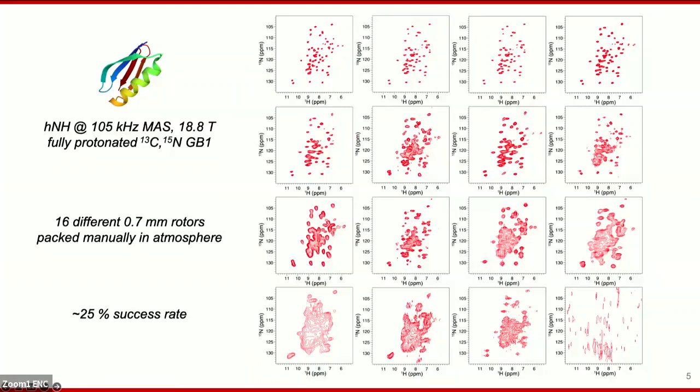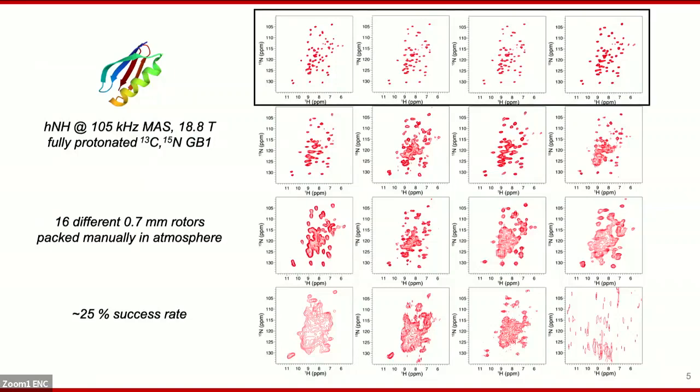So when we design a packing process or a packing tool, we want to make sure that we're so confident in this tool and in this protocol that we can get the best spectra every single time. So yeah, those are the four that are the best.